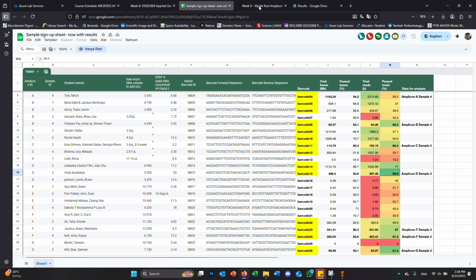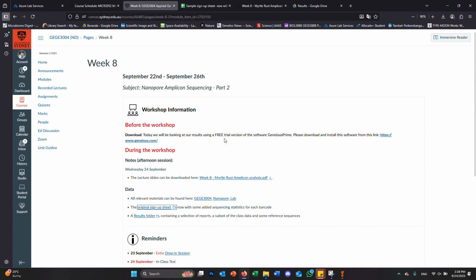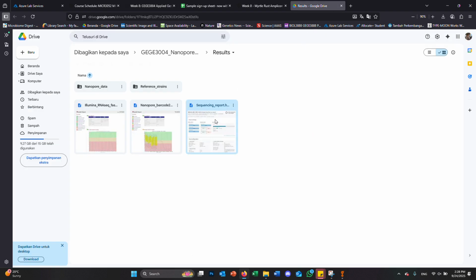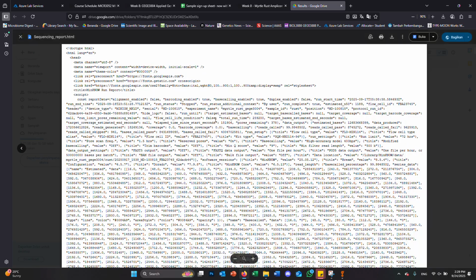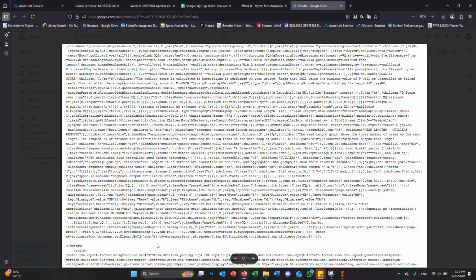So this is the one thing that I don't like about FastQC, is it doesn't give you a key for any of the plots. So we've got a really big, bright blue box here. It's a quality one, and I think the fact that it's all blue is that the quality is all good. It's just quality. So sometimes you see sort of patchy white bits. Show me the Nanopore one. Average quality. Yeah. Where's the Nanopore one?